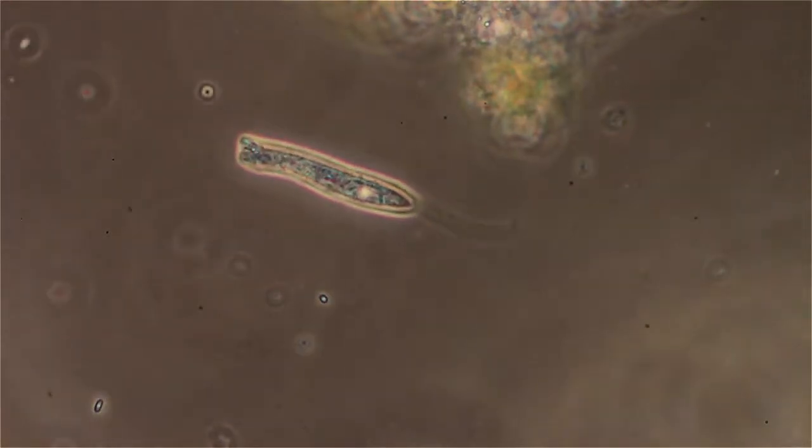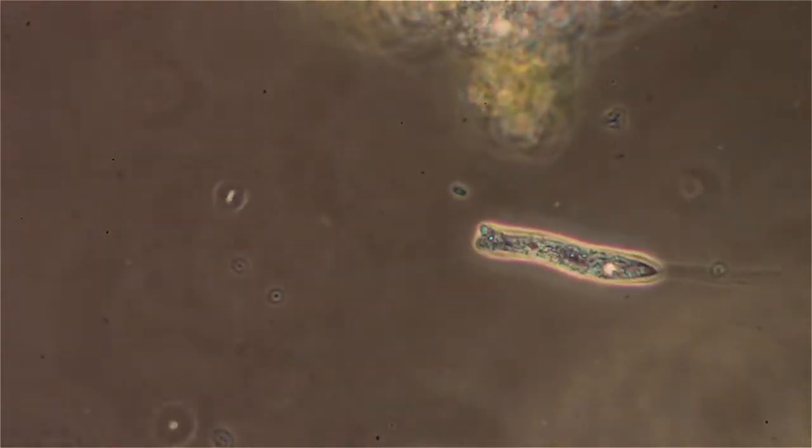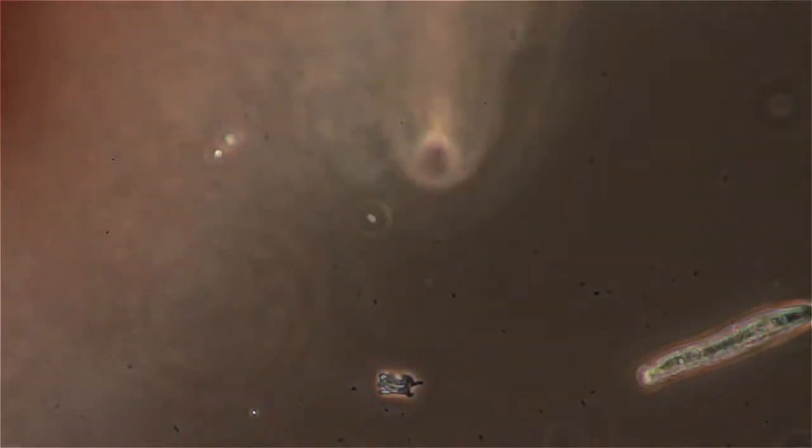This is a peronema. I don't know exactly what species it is. That looks like a tiny amoeba.